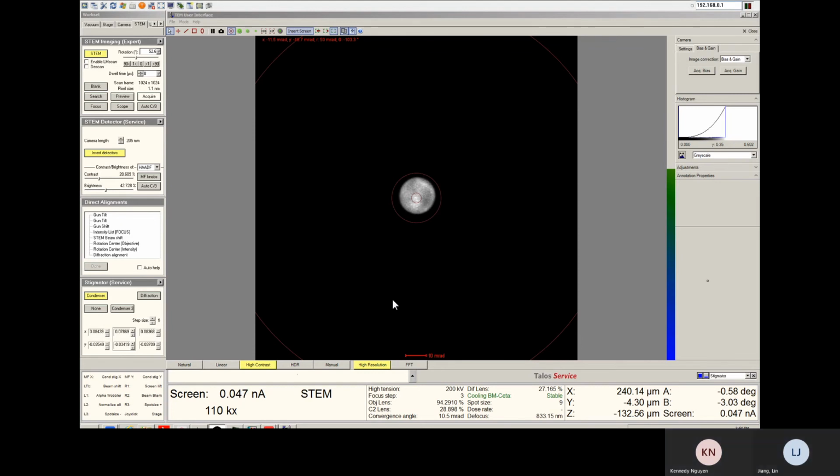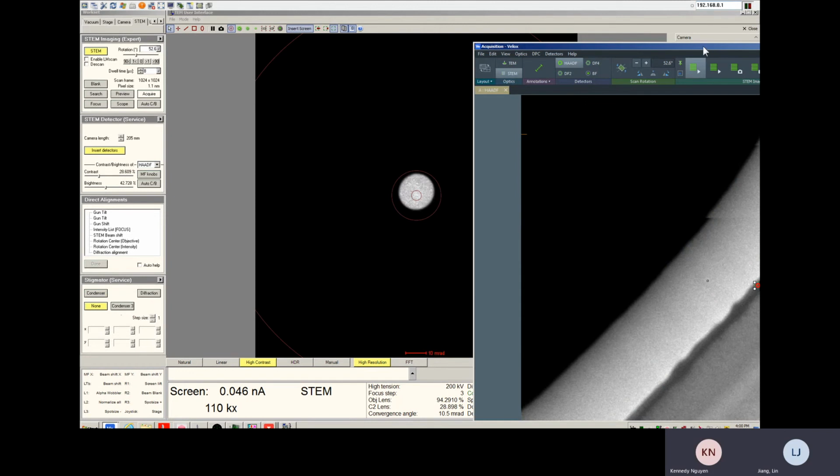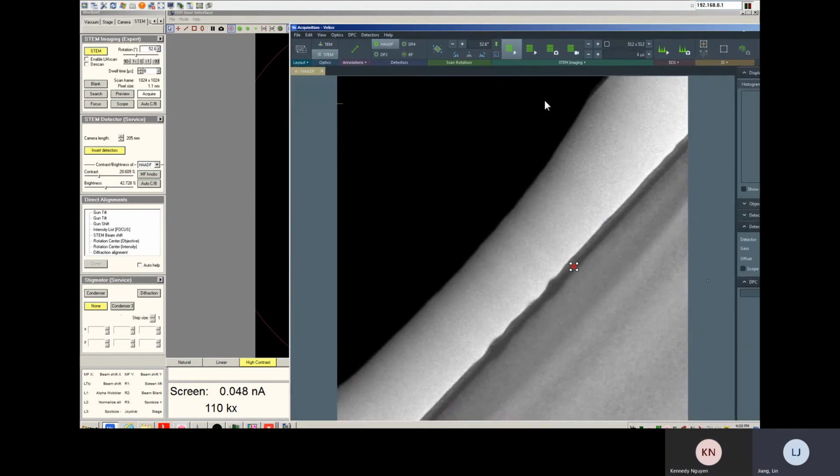Okay. No, it's pretty close. Okay. And then you have the region, which is the region of interest.